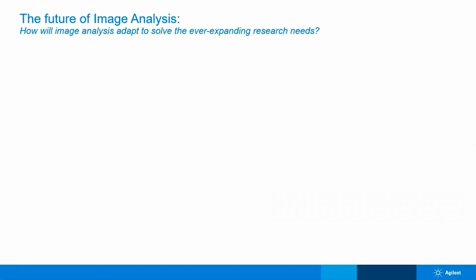I've spoken a lot about what we have done to develop Gen 5 as the needs of our customers have grown and evolved over time. But I often get the question of where I see image analysis evolving in the future and what will influence that progression. As I look at key technology available on the market today, there are two areas that will have strong influence moving forward in my mind.